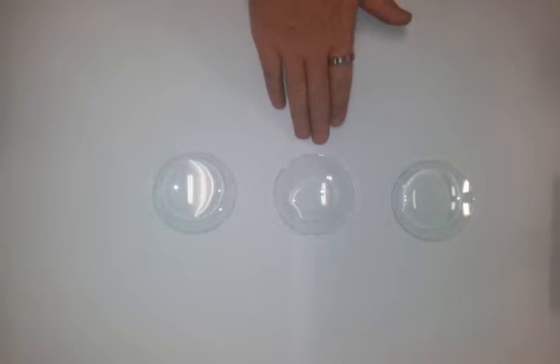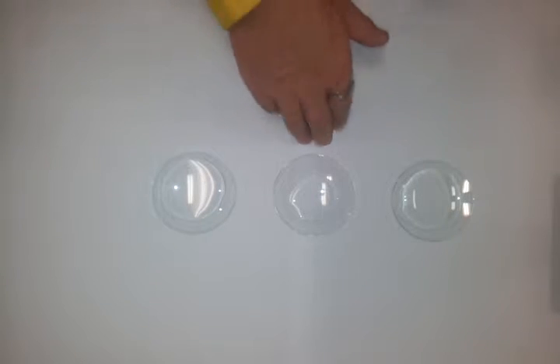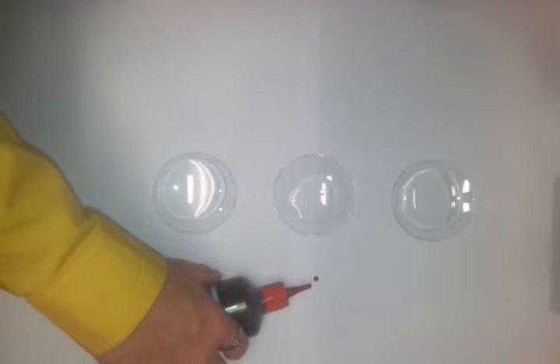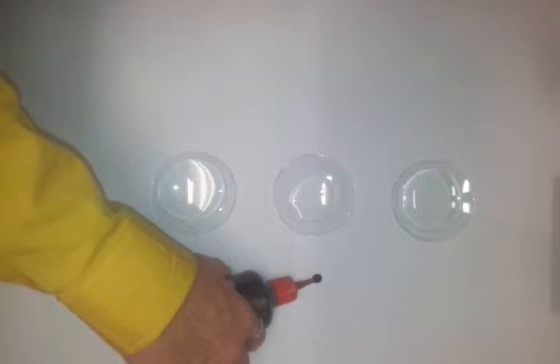conditions. I've added nothing to the peroxide here, so it should be neutral, because peroxide is neutral. And here I've added sodium hydroxide to make it alkaline. The one that you should be used to is, and I'll just put a drop of permanganate on here so we can see that it is quite a dark purple colour.